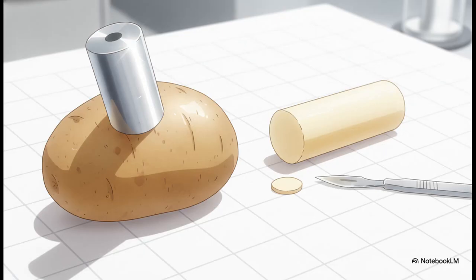Now, the absolutely crucial point here is that to truly observe this phenomenon, we have to be absolutely ruthless with our scientific method. Notice how we can't just casually hack up a potato. No way. We use a specialized tool called a cork borer, so every single potato cylinder has the exact same diameter. Then we use a scalpel to trim the ends completely flat to ensure equal surface area. They're all going to stay submerged for exactly 30 minutes. And, critically, we'll use the exact same gentle blotting technique before weighing them. We are literally eliminating every single variable except one.